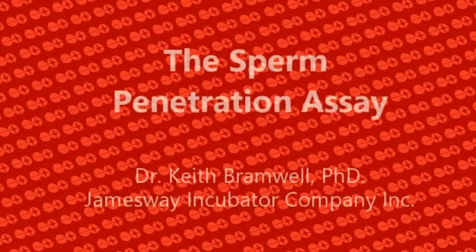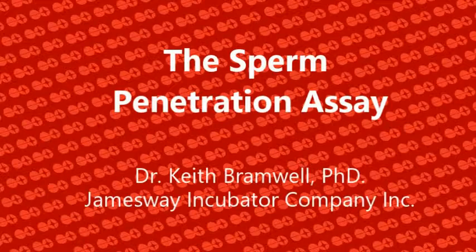Today we're going to talk about the sperm penetration assay. This short video will show you the step-by-step procedures on how to do this test. It should be accompanied with literature that will give you all the equipment, materials needed, plus the step-by-step portions as you will see in this video.